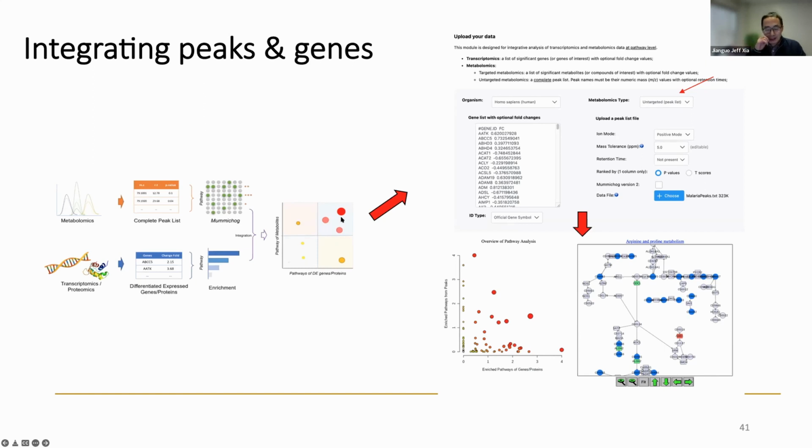So here, if we upload the genes, and here's the untargeted peak list, it will be a file because this is not going to be copy and paste. It's a big file. After that, you go here, and this is arginine and proline metabolism. This, I think, is the immune cell stuff. We don't see a joint signature. It seems both are there, but one is detected by metabolomics and a pathway only detected by transcriptomics. This is not surprising. This is quite common.